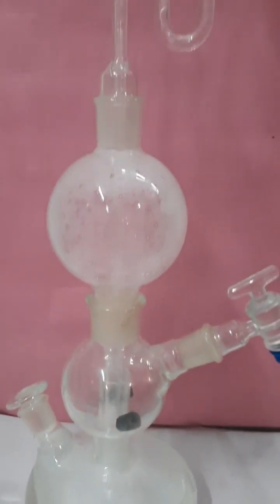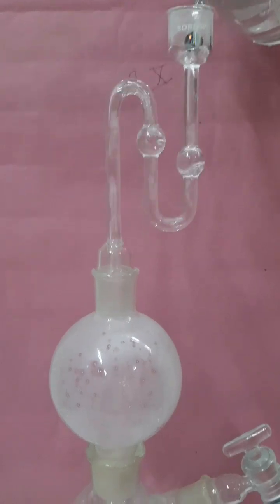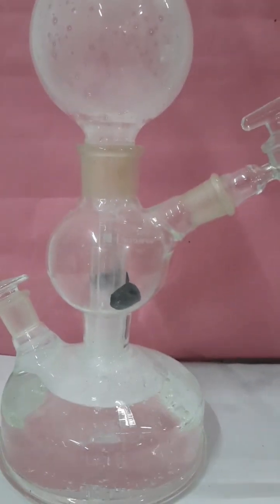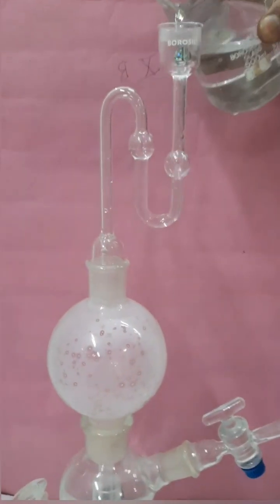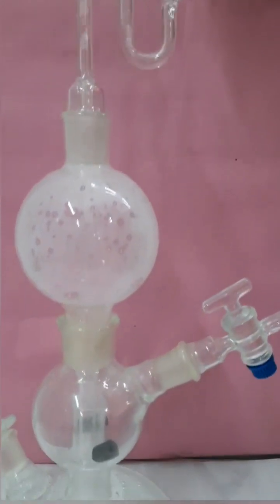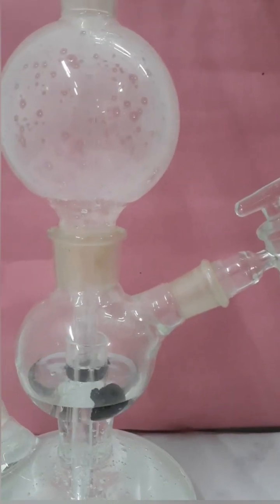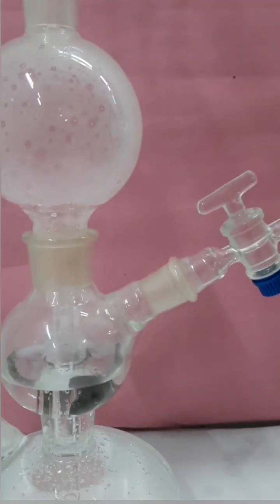The retention plate present in the middle chamber contains a hollow conical tube with a small hole that allows the passage of liquid as well as gas between the middle chamber and the third chamber. The ferrous sulfide stick should be large enough so that it is retained in the middle chamber only and does not fall into the lower chamber. Sufficient amount of acid should be added such that it covers the ferrous sulfide stick in the middle chamber.